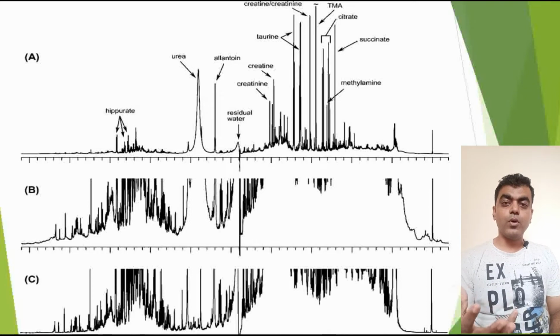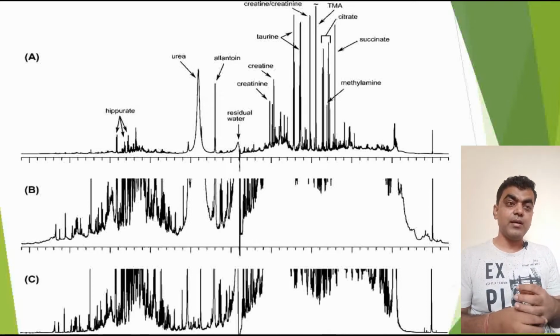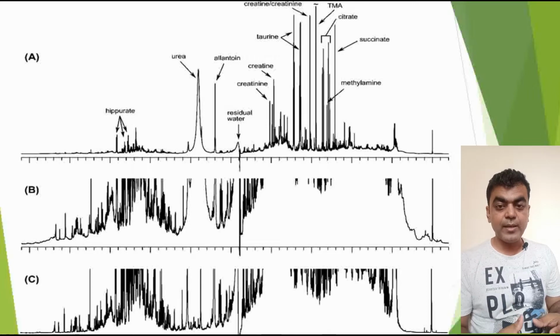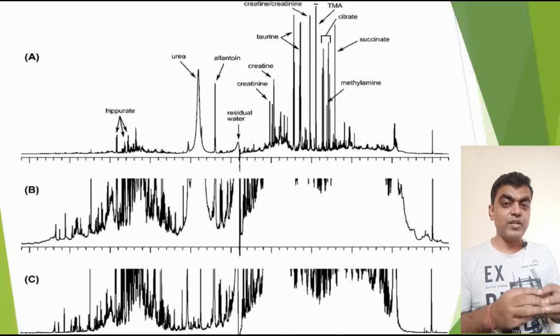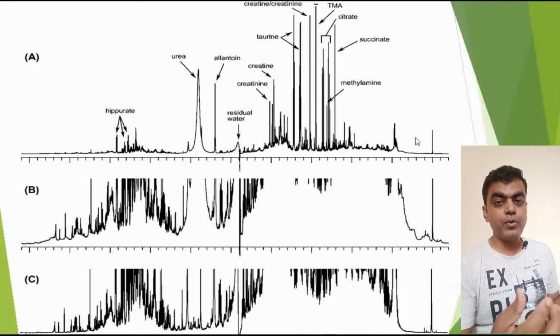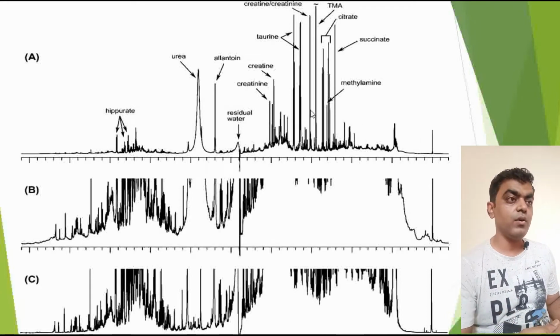Now this D2O will not have resonance, it is not magnetically active, and it will not give any resonance in the NMR presence, right? So in the presence of D2O, you will not get any signal here, and you dissolve your sample in the D2O, whatever it is, if it is a pure compound, protein or whatever.